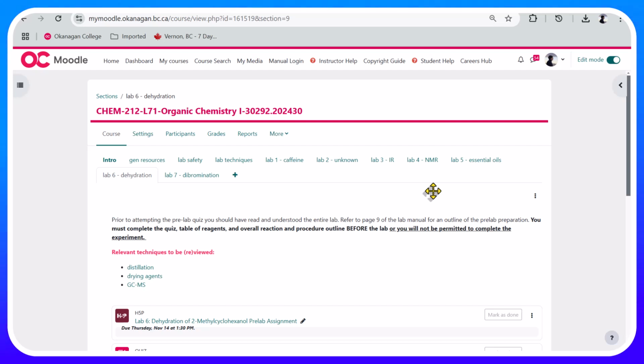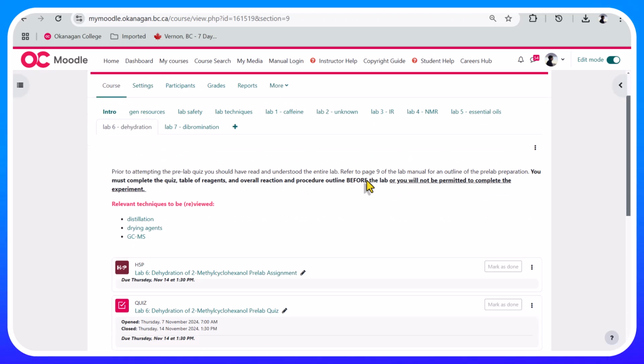In this short video, I'd like to talk you through how to access and process some of the data that you get from your mini GC analysis. So I'm looking here at our Chem 212 lab page, and in particular under the dehydration tab.